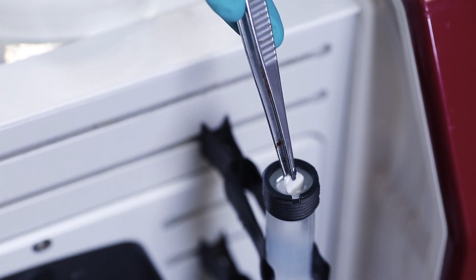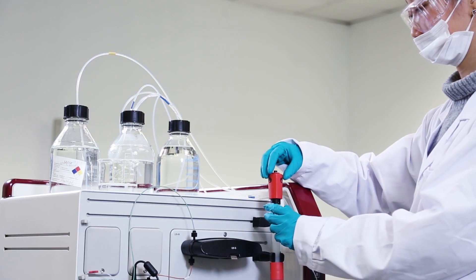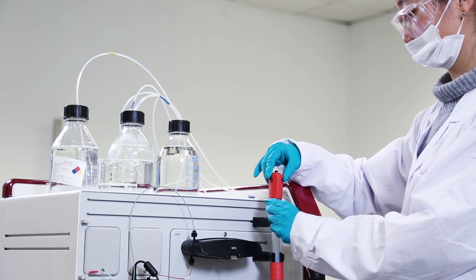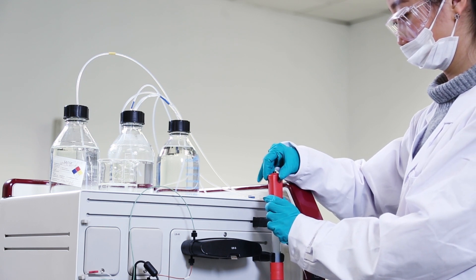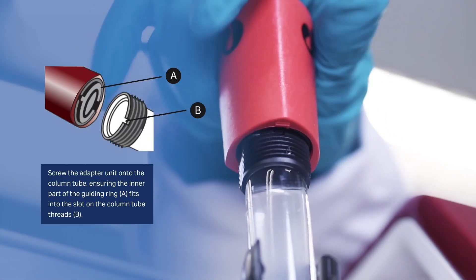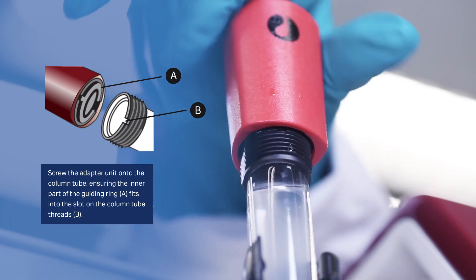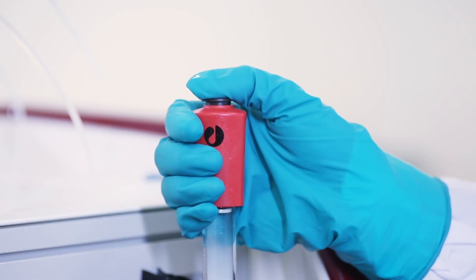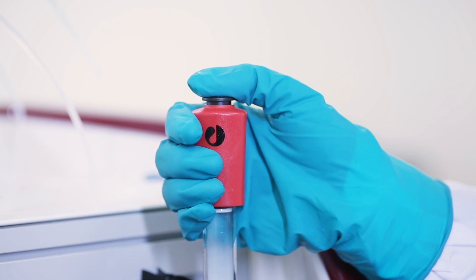Add packing solution if the slurry does not reach the top. Wet the top filter in 20% ethanol and place it on the top of the column. Now take the top adapter, making sure the O-ring is intact and insert it into the reservoir. Ensure that the inner part of the guide ring fits into the slot on the tube threads. Add the locking ring to hold the adapter in place.